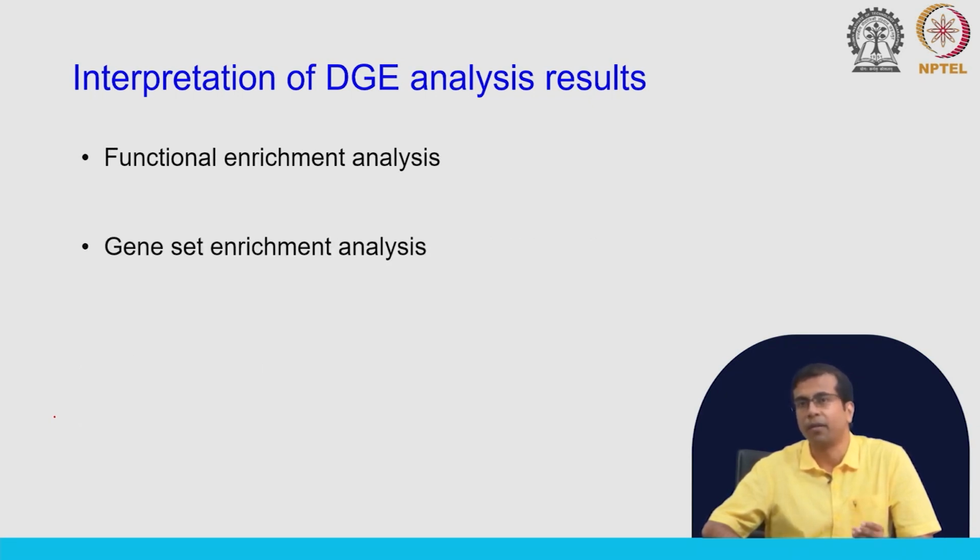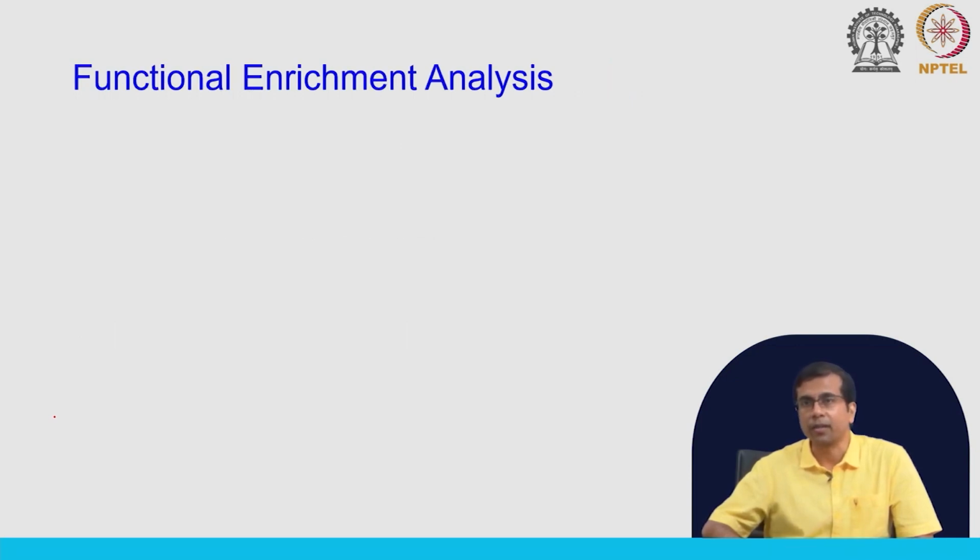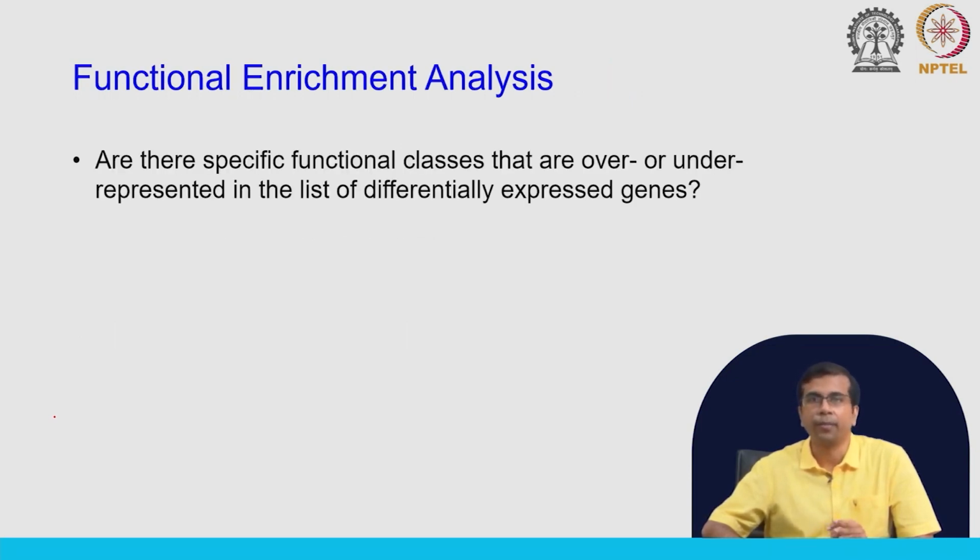Sometimes these are also called gene set enrichment analysis, although there is a tool that is actually called gene set enrichment analysis, or sometimes we call this pathway enrichment analysis. These are kind of equivalent, but not exactly the same. So let us now go into the functional enrichment analysis.